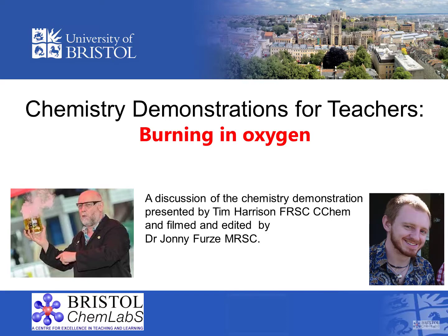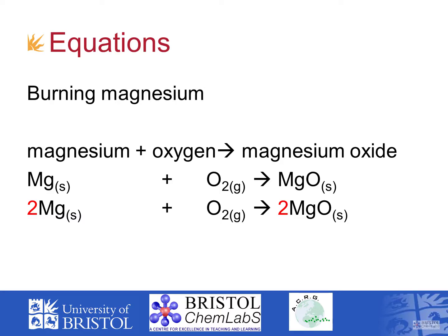In this short video we're going to look at the use of gas jars and deflagrating spoons, that's burning spoons. It's typical that teachers demonstrate the burning of magnesium and the burning of sulfur in oxygen.